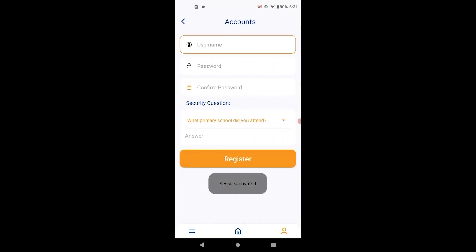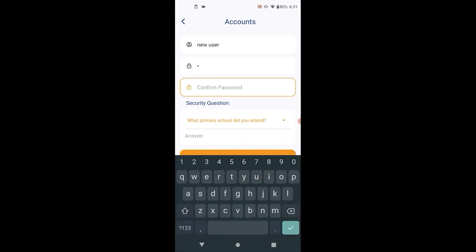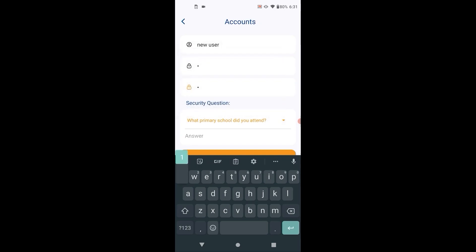First, we create a new account, confirm the password and security question for password recovery.